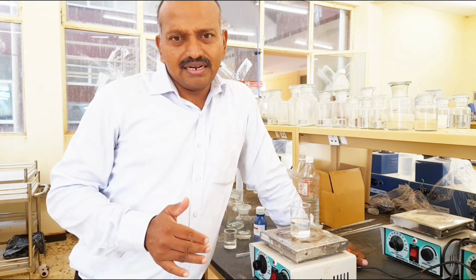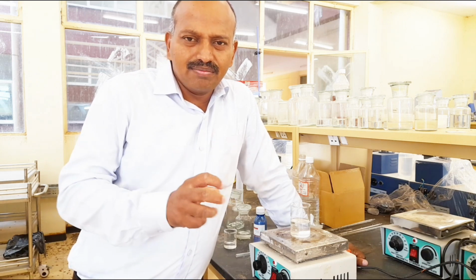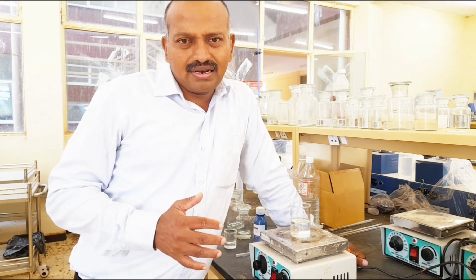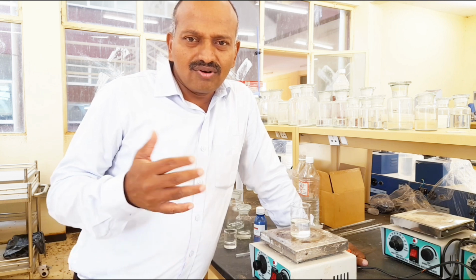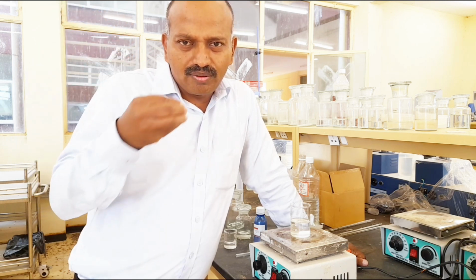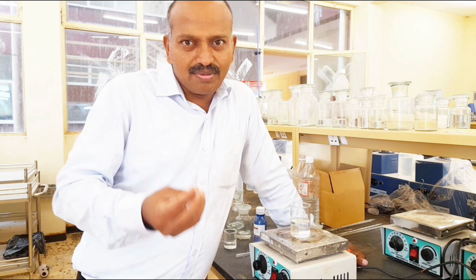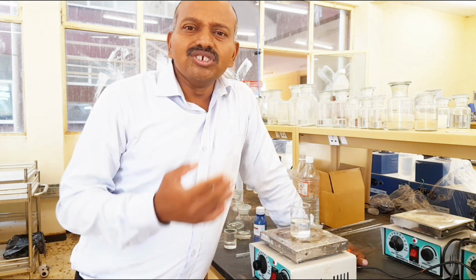Phenolphthalein indicator exhibits pink color in the basic medium because sodium hydroxide is a base. When the titration is going on, sodium hydroxide converts into sodium chloride and finally the reaction becomes neutralized. When you add an excess of one drop from the burette after the reaction is completed, at 14 ml exactly, the mixture becomes acidic in nature.